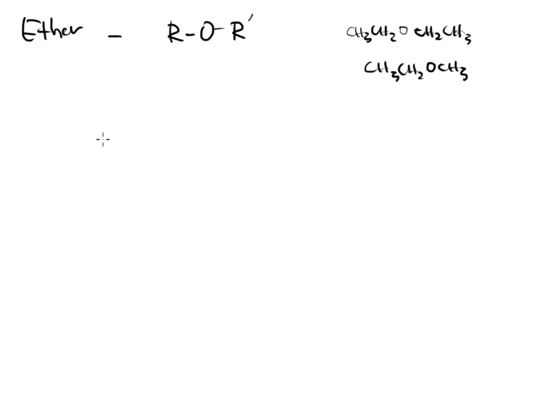An ether will cleave. So let's say that we have ROR. An ether can have the possibility of cleaving on that side. And if they're different, it could also have the possibility of cleaving on that side. No big deal. We would do that anyway through the normal thought process of getting these fragmentation patterns. I mean, that would be something that we would expect. The oxygen can take all the electrons and it can go away, and the positive piece goes on the other side.